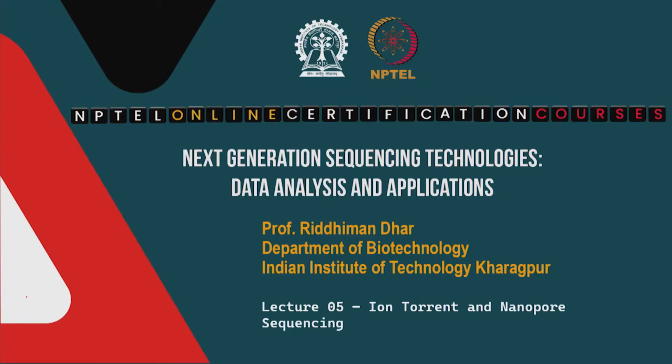Good day everyone, welcome to the course on next generation sequencing technologies, data analysis and applications. In the last few classes we have introduced some of the recent NGS technologies. We have talked about Roche 454, we have talked about Illumina, and then in the last class we have talked about SMRT sequencing. In today's class we will discuss two sequencing technologies in brief. One is called ion torrent sequencing and the other is nanopore sequencing. So, that is the agenda for today's class.